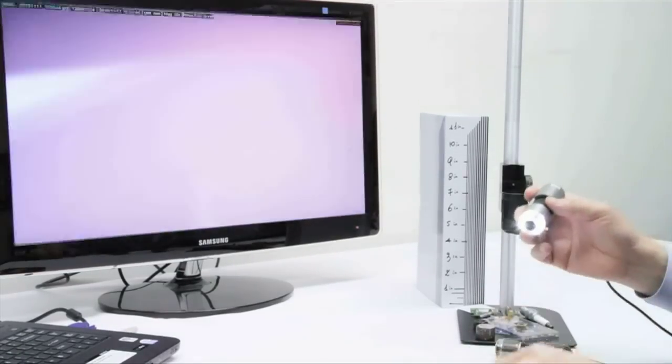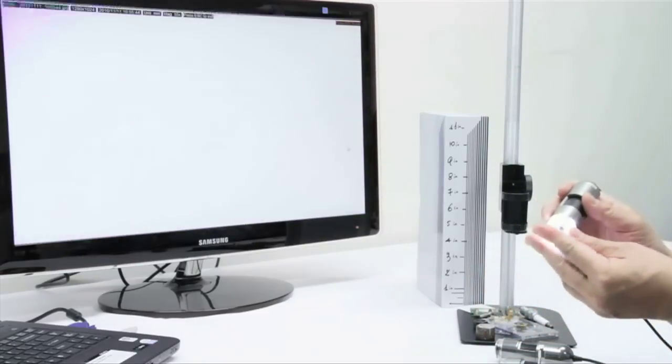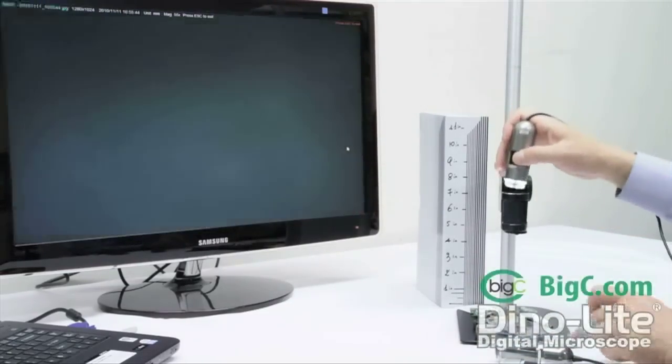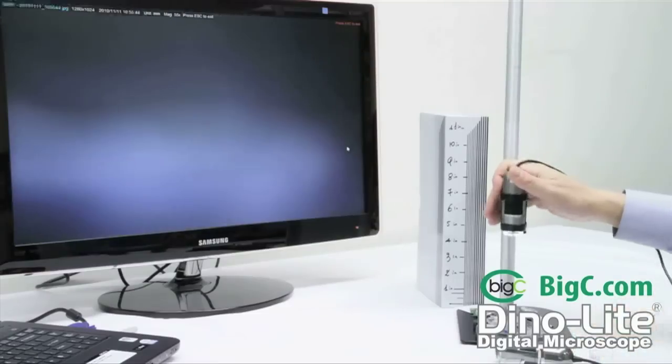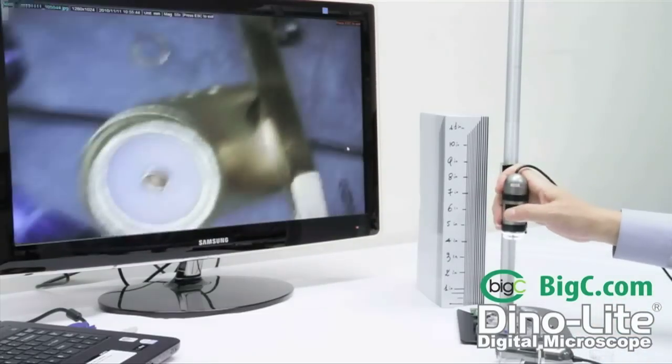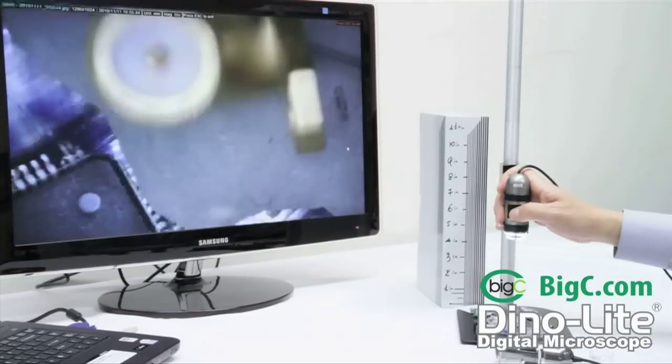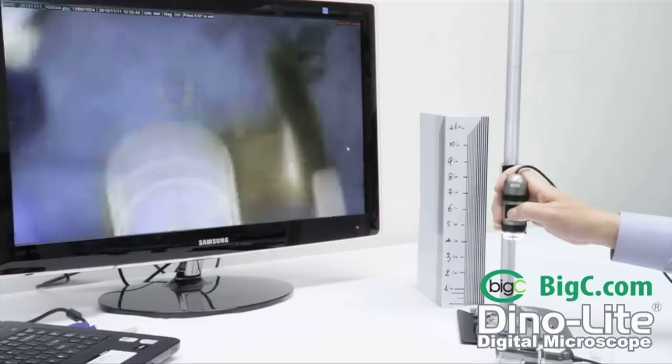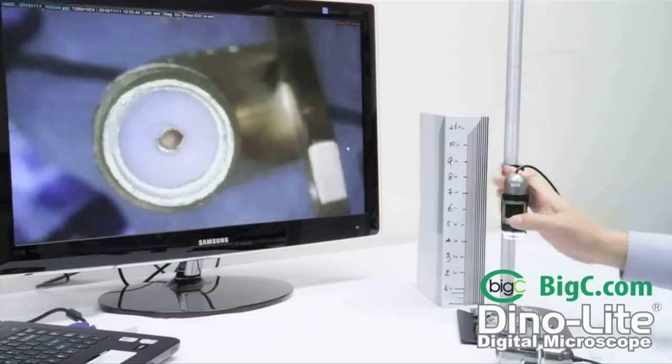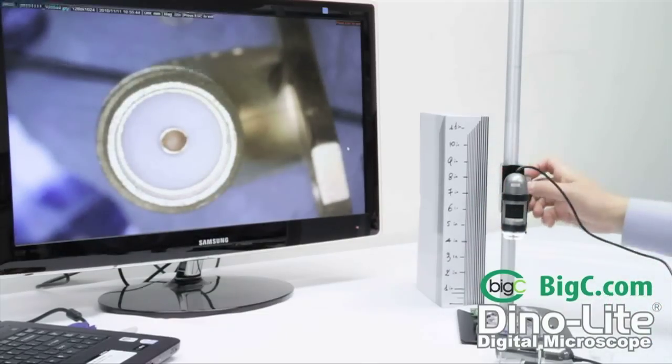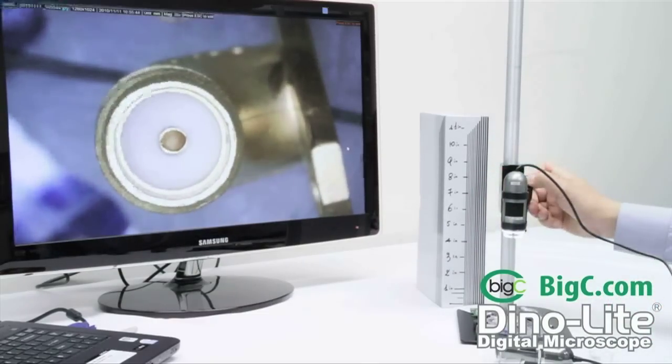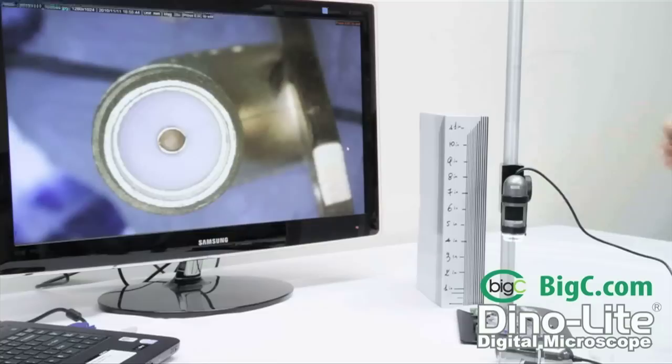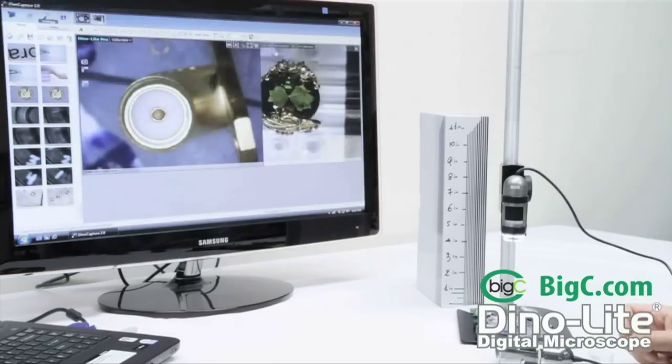We do suggest to use this microscope with a stand because the microscope does have to maintain a two and a half inch distance from the object. It does get a little shaky when you are using it handheld, so if you do have it in the stand, we do recommend that. That is better to reduce the shakiness and actually add some rigidity to it.